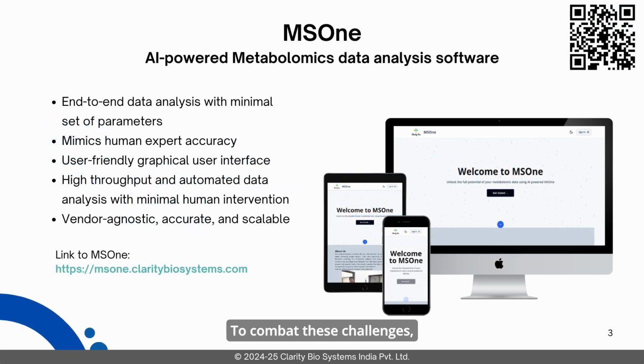To combat these challenges, Clarity Bio has developed MSOne, an end-to-end metabolomics suite enabling high-throughput analysis with minimal parameters and human intervention. Powered by AI, MSOne delivers expert-level accuracy through a user-friendly interface. It's vendor-agnostic, scalable, and built for robust automated performance.